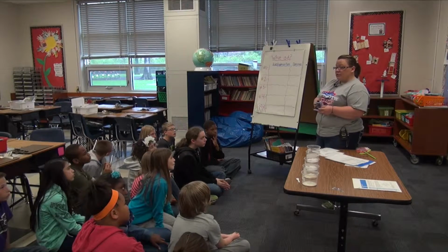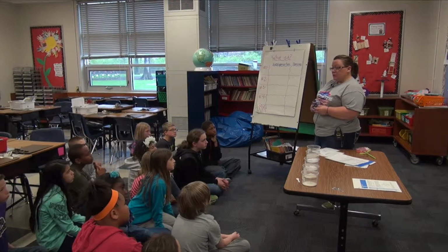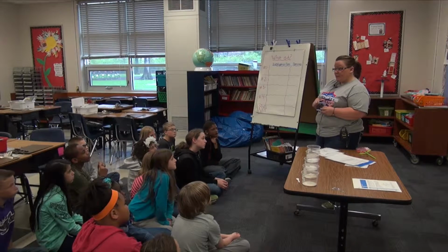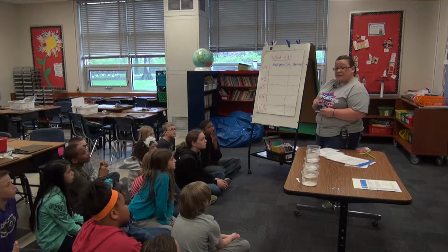Yeah. You need to make sure the thick plastic is towards your tummy, and then you need to use the reflector and the light source to catch the ceiling. You make sure your slide is on top of your stage, and then you may turn your eyepiece if you need it. Yes, Kaden.